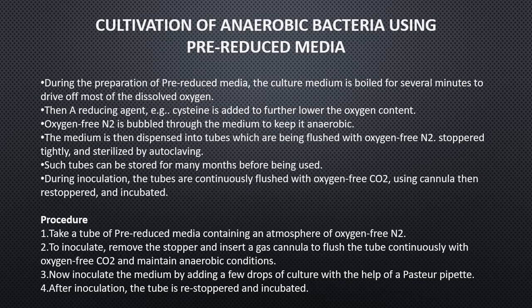Then about the first technique, that is pre-reduced media, which we use to cultivate anaerobic cultures. These media are commercially available, but you can also prepare them in your lab. It depends on your priority, or what you can work with.